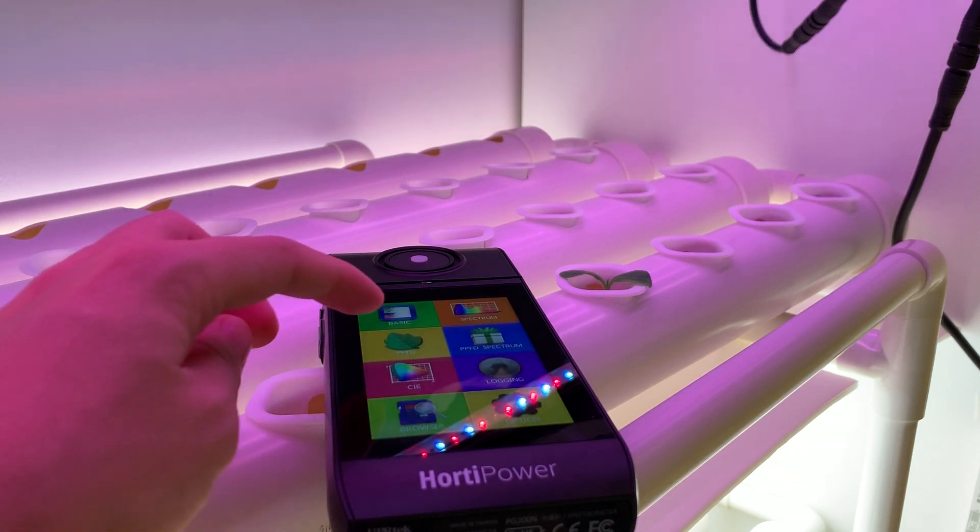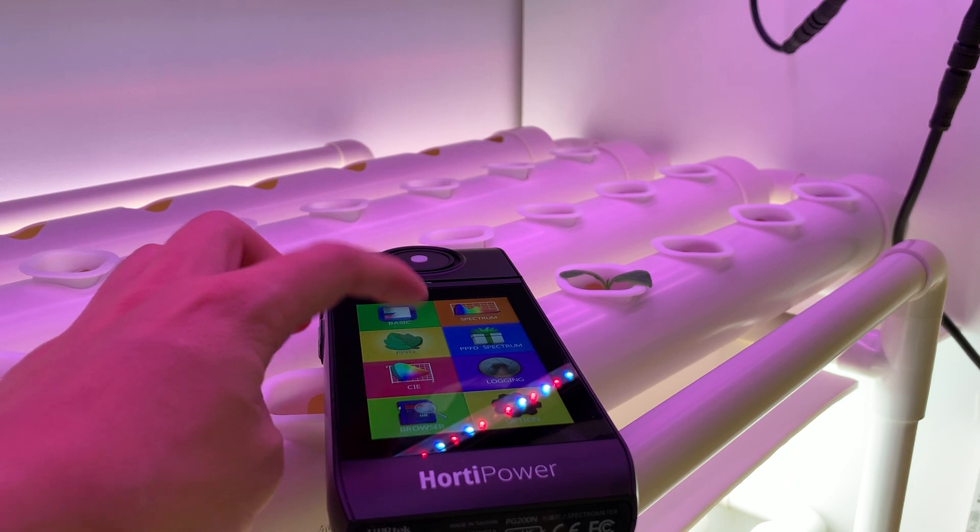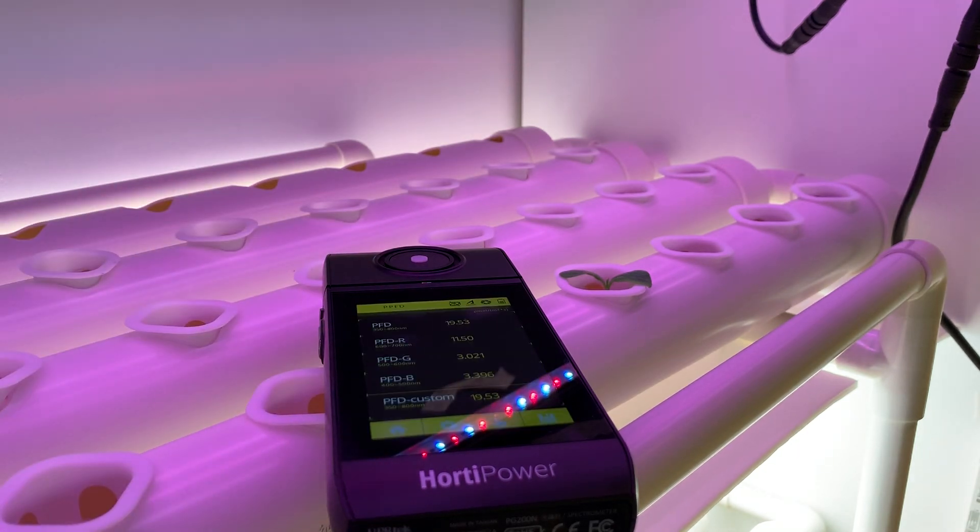The other part that we can measure here is the PPFD or the PFD. PFD is basically the amount of light that hits the leaf surface of a plant, or wherever we put the meter. It measures the amount of light — in this case it's 19.53 micromole. So with these two functions we know two important aspects of light.